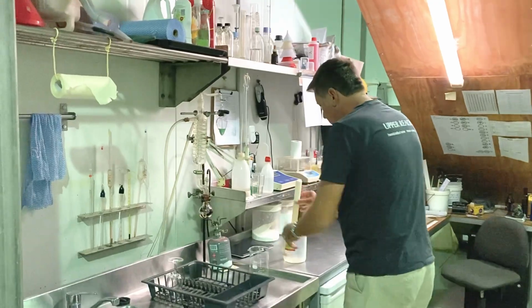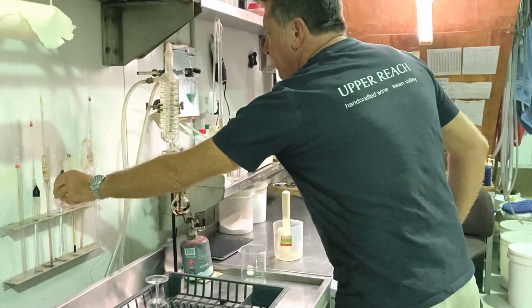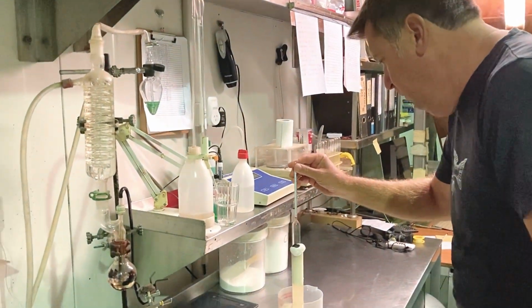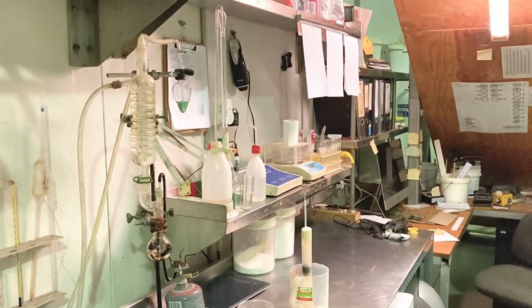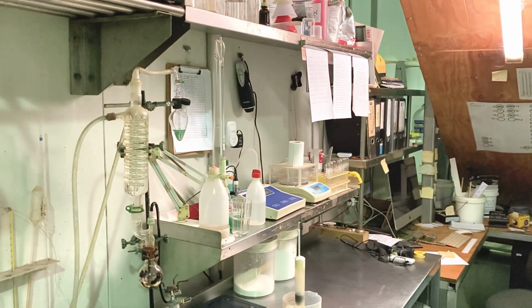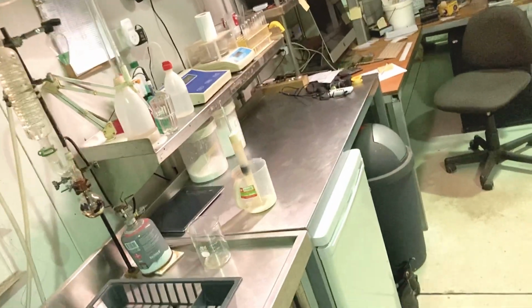So he's taken the sample out of the tank. You can see it's in the measuring cylinder. Now he's choosing a hydrometer to use. This is going to measure the specific gravity in the wine, and that actually will give us a reading of the Baume. So you can see the hydrometer there is sort of balanced in the wine in that measuring cylinder.